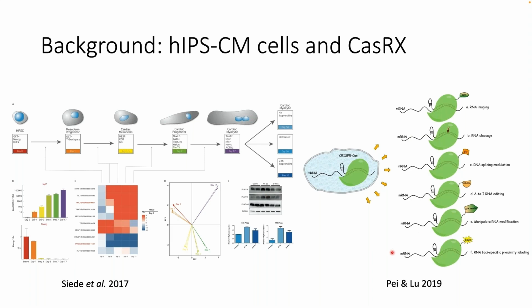Of course, we wanted to know whether the cell type as such differs from the unedited background cell line, and if so, in what way. And that is why we set out to do single cell sequencing.